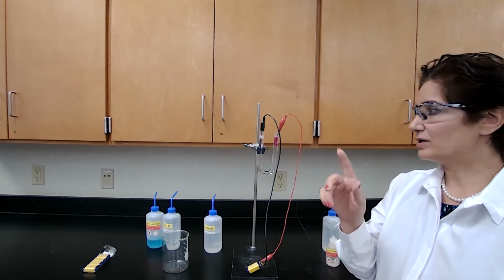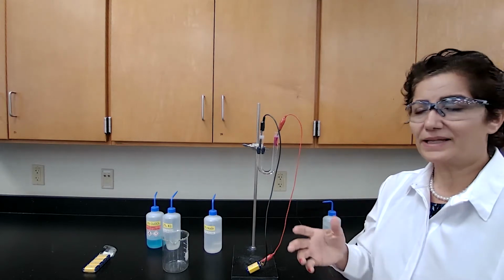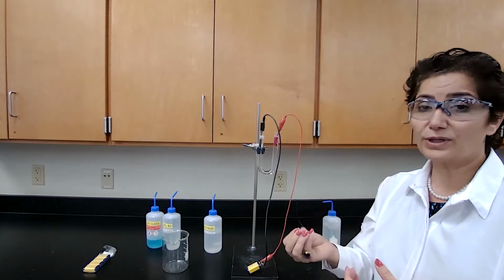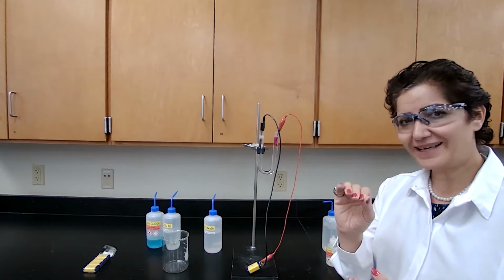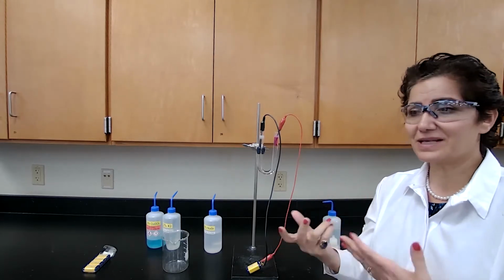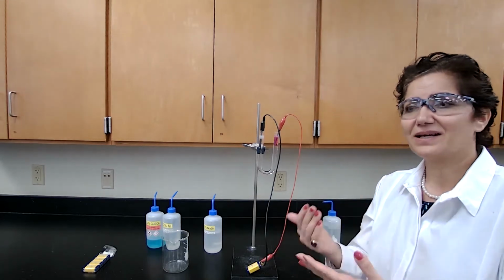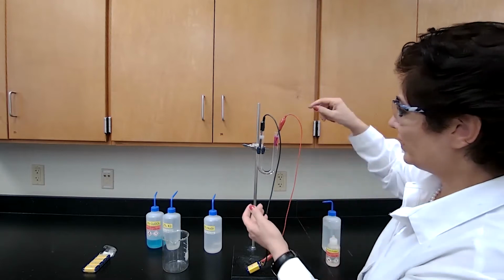The other option for oxidation was chloride. If chloride is being oxidized, it is going to produce chlorine gas. Chlorine gas smells strong and has a light yellow color. So I have to check for those evidences, and whichever comes first, I take it, and I will say that yes, based on this evidence, chloride has been oxidized. So I know water has been reduced.